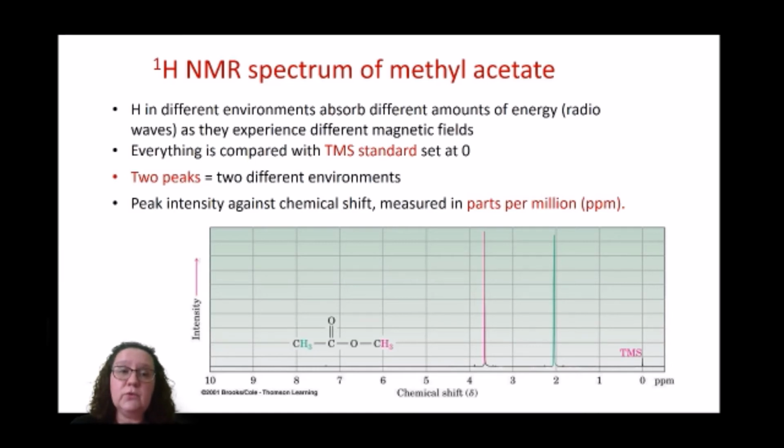Those hydrogens, the nuclei of those hydrogens, will absorb different amounts of energy, different radio waves, depending on their environment, depending on what's surrounding them. And they will experience different magnetic fields, and that's what you detect in an NMR spectrometer.